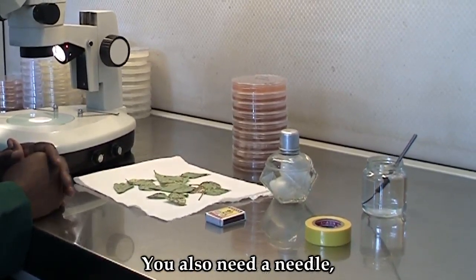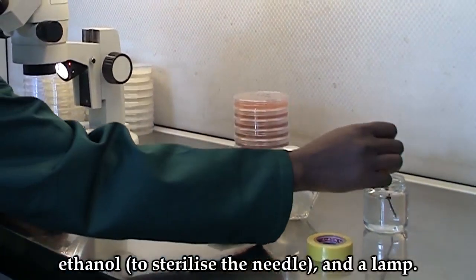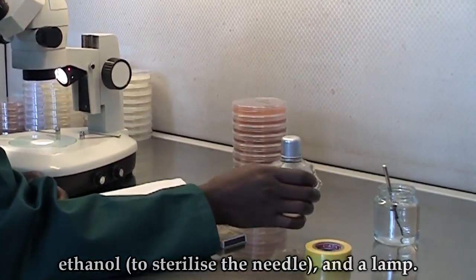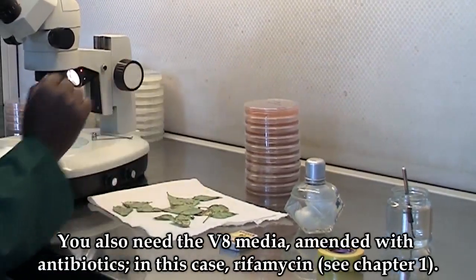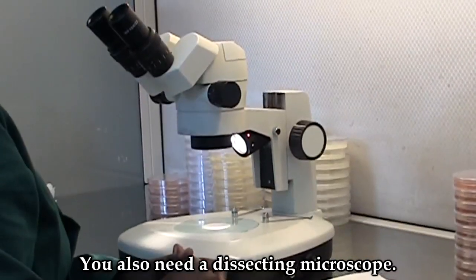You will also need a needle, ethanol to sterilize the needle, and a lamp to sterilize the needle. You will also need V8 media amended with antibiotics — in this case, rifamycin. You will also need a microscope.